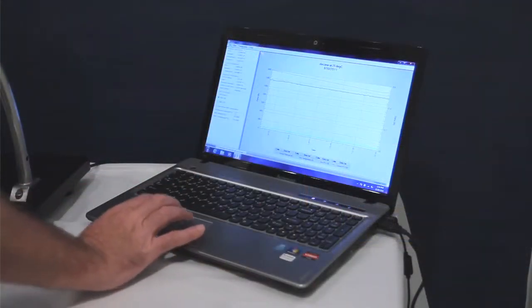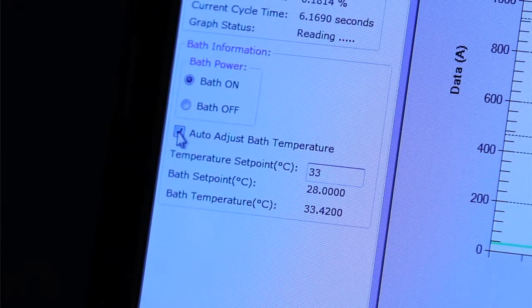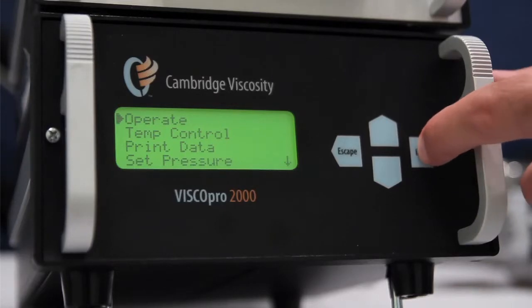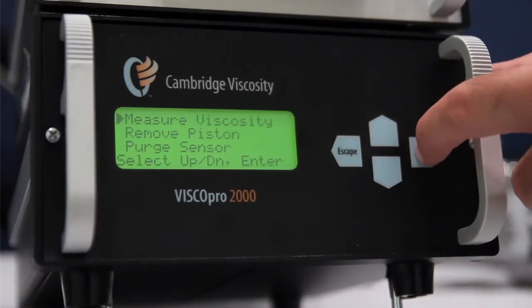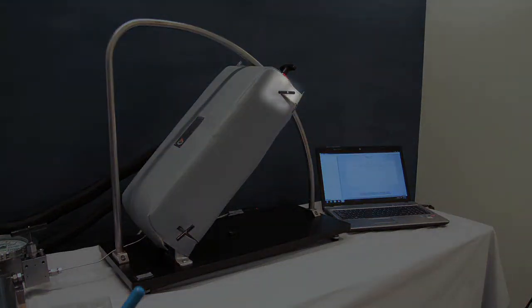Set the bath temperature on the PC display to the desired set point using the ViscoLab PVT software. Make sure the ViscoPro 2000 is in measure viscosity mode. Adjust the pressure until your desired test pressure has been reached by turning the fine adjust valve.